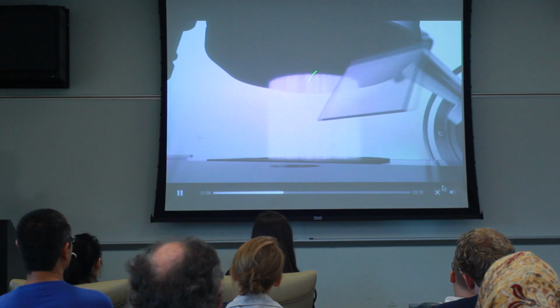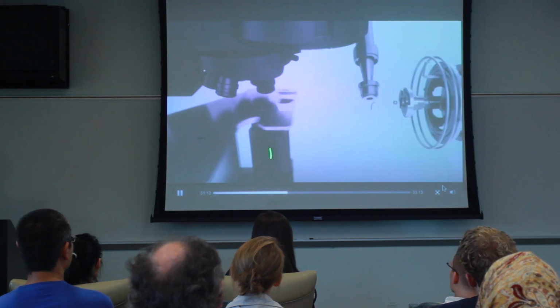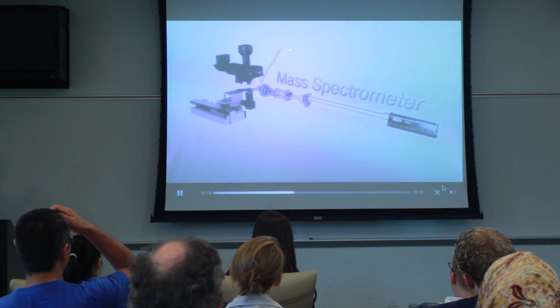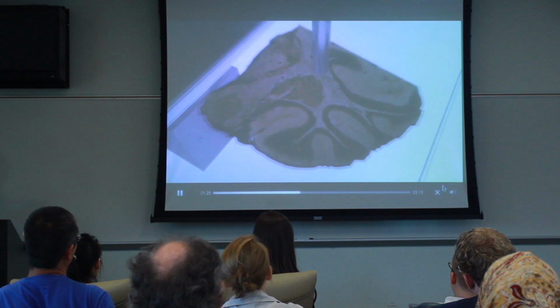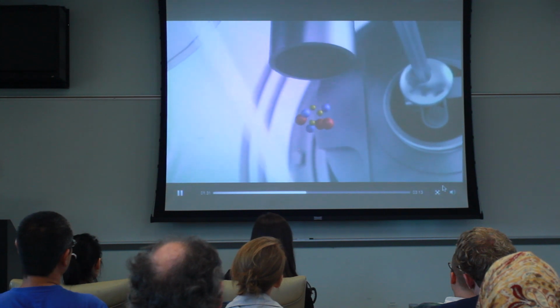And this is only a light microscopy, but you can imagine how, as this is developed further, one could use fluorescence microscopy and more sophisticated techniques. Then that's robotically moved into position in the mass spectrometer so that it's able now to be irradiated by laser light in this little tube that collects the ions that come across the surface to go into the mass spectrometer.